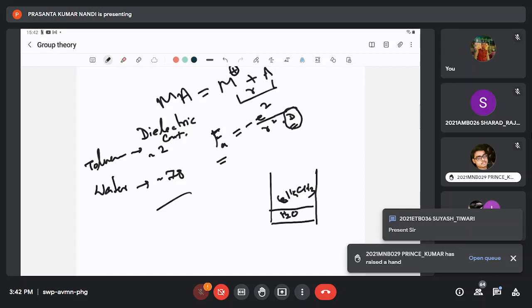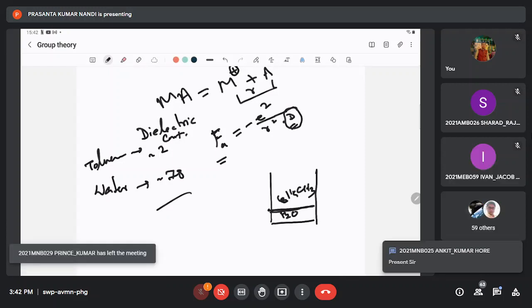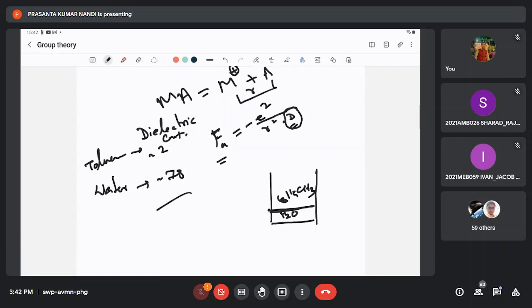Even after some time, you can identify this junction, a demarcation where you can visualize the boundary of the two layers.